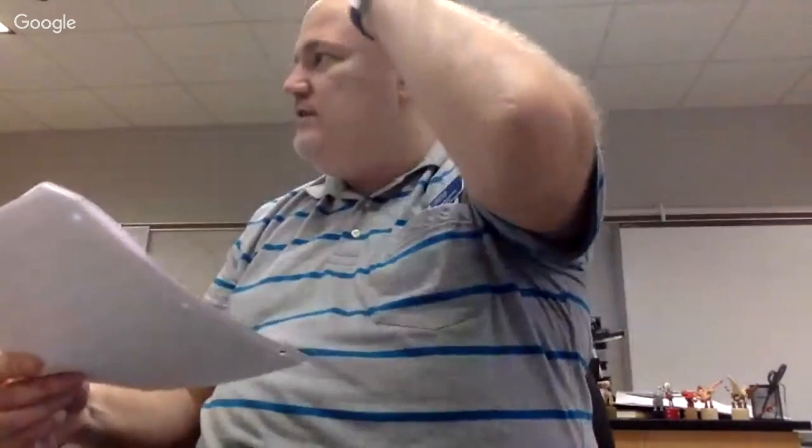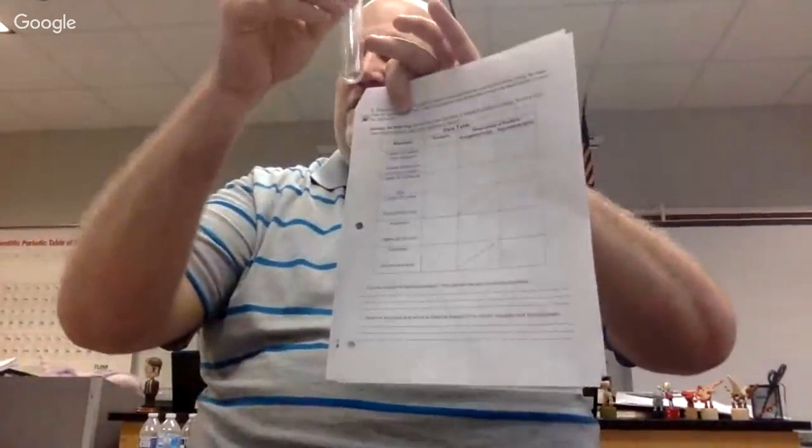You can do that at the very start of the lab. But let me finish. That's not a bad idea. That will allow you to know what's in each step. Now watch. When you put the 2 chemicals in here, immediately you're going to see some sort of reaction. You're going to describe the solid and the liquid. Now, remind yourselves of this. A solid isn't going to be like, boom, a piece of metal comes out. A solid is like if you take 2 clear liquids and you mix them together and they turn cloudy, that cloudiness is a solid. So you describe what that looks like. If it looks cloudy, then say it's cloudy. If you see that it has a particular color to it, then you describe that color.